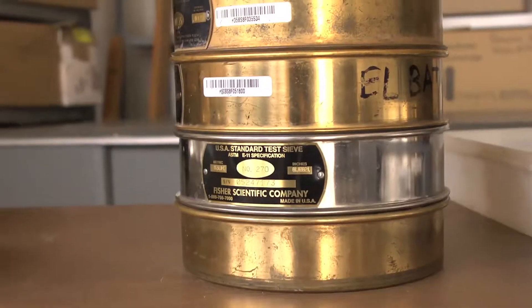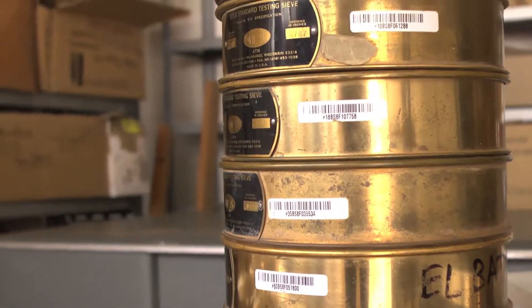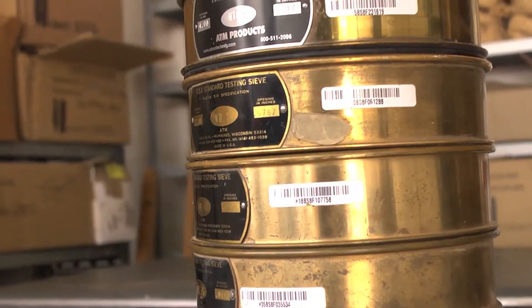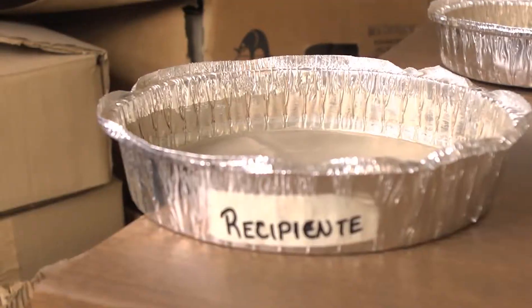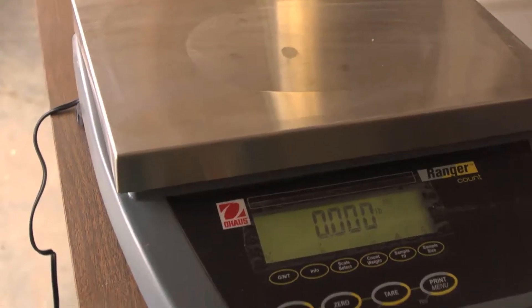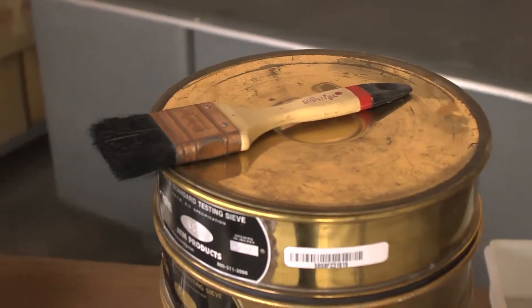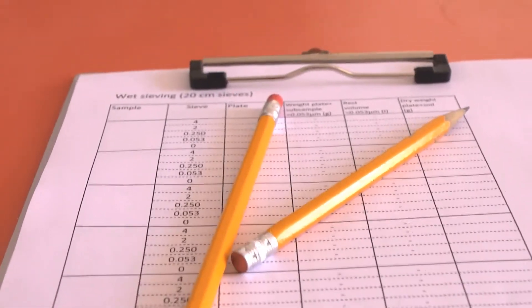The equipment needed for this protocol is a stack of sieves with openings 4, 2, 1, 0.25, and 0.053 millimeters, a shaker, numbered trays, a stopwatch, a scale, a brush, a large plastic tray, data sheets, and a pencil.